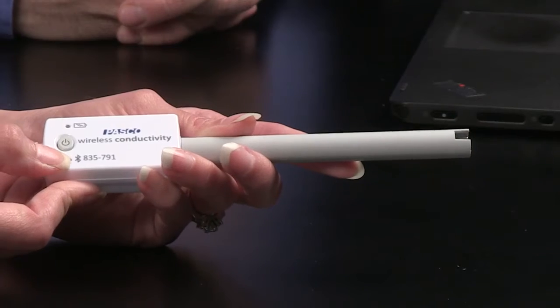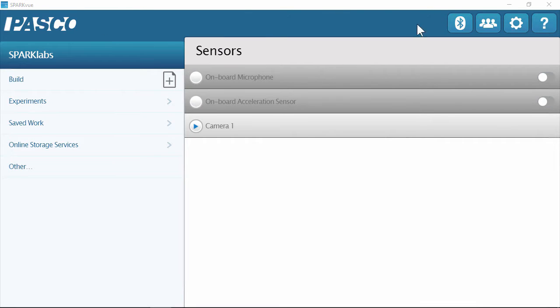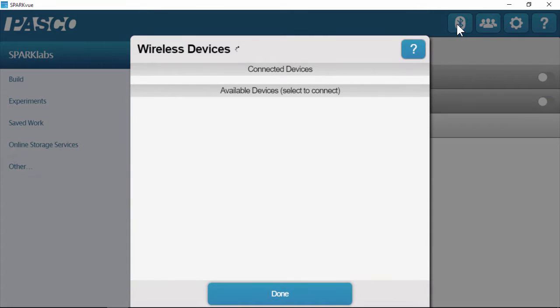When I turn the sensor on, I can see that the Bluetooth light is flashing red. That tells me that the sensor is ready to connect in the software. So now I'm going to go to my software and pair it using the Bluetooth icon. I can see that sensor in my available devices. If I had a room full of these, they would all appear there, but the one closest to your device will be on top of the list — and that's great for classroom management.